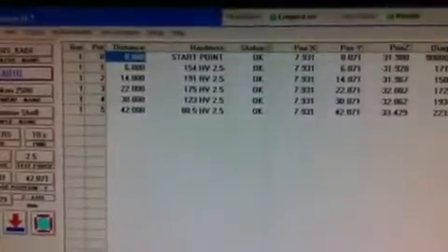What we're left with is our data, which could then be easily exported to different programs such as Microsoft Excel, or a predefined template using Crystal Reports.